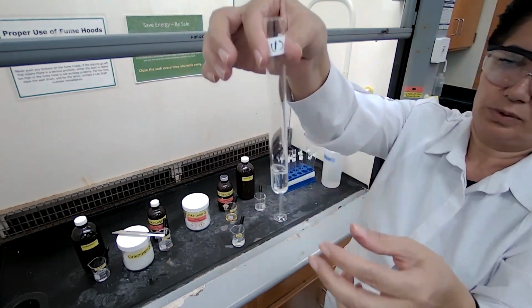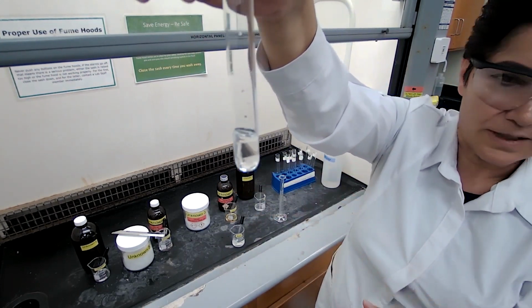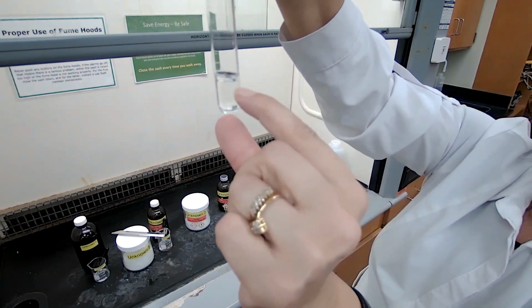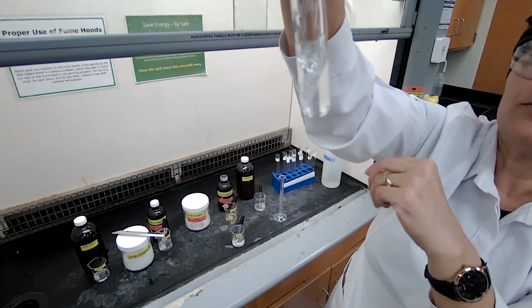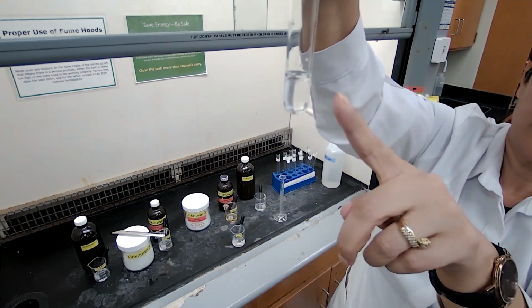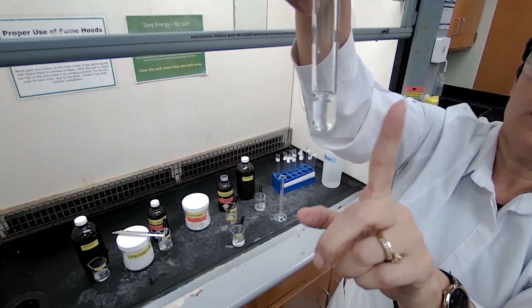This is for the video purpose. If you were in the lab, you didn't have to do this. There's 1 layer of the unknown, and then this is the water. So we have 2 layers. If 2 layers form, that means the compound is not soluble in this solvent. So unknown 1 is not soluble in water.